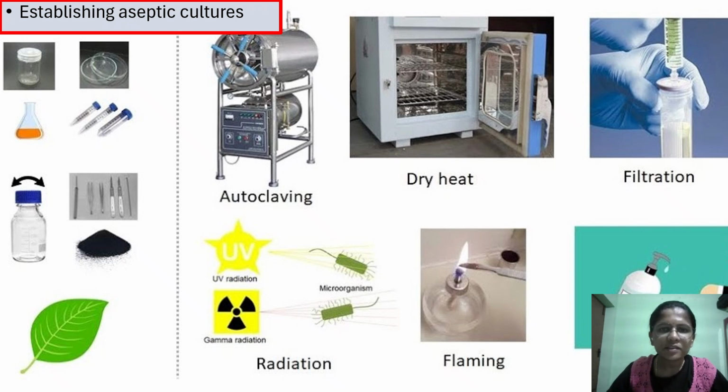So we will see next how to establish this aseptic culture in order to achieve contamination free tissue culture plantlets.